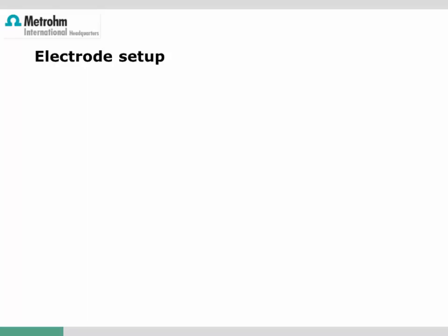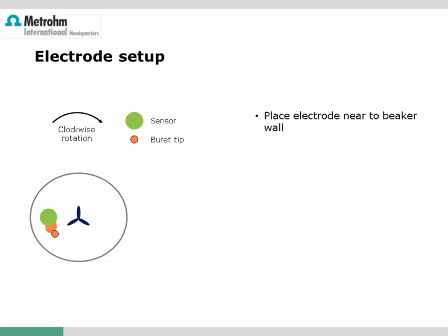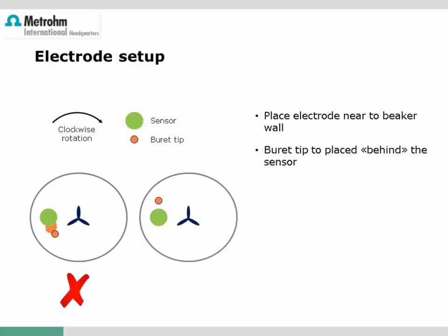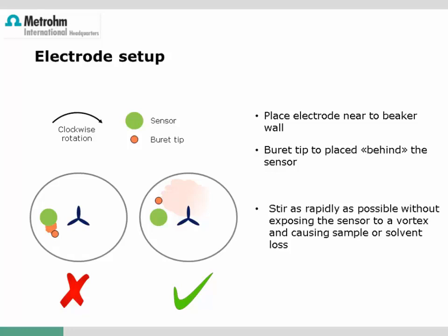However, the choice of burette, sensor, and stirrer itself is not sufficient to guarantee a successful titration. The arrangement of the stirrer, sensor, and burette tip are very important, and this is very often underestimated. We clearly recommend documenting the electrode setup in an application document, either by a detailed description, a picture, or a technical drawing. The burette tip should not deliver titrant directly to the sensor, as the sensor may indicate a too-high titrant concentration before it has distributed and reacted with the analyte. It is much better to place the burette tip behind the sensor.